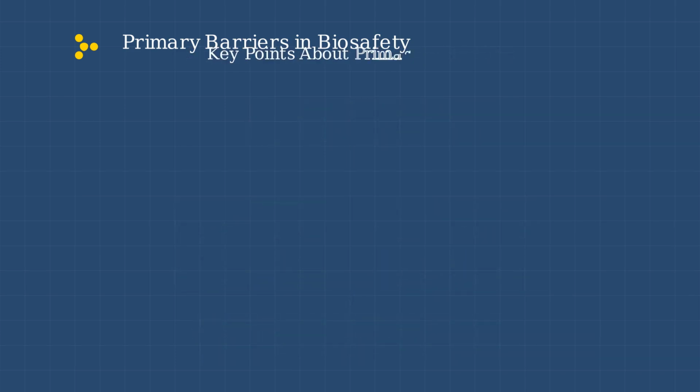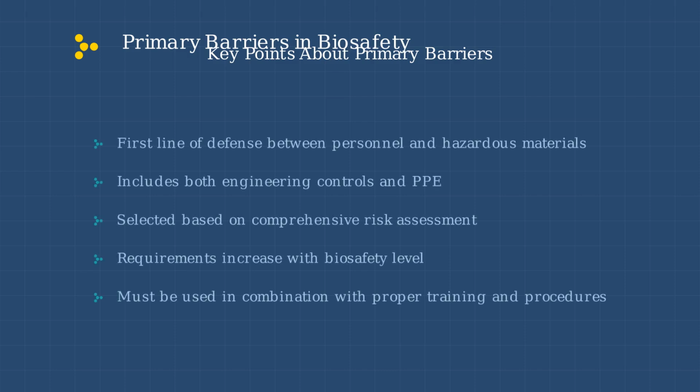In summary, primary barriers are essential components of biosafety practices. They form the first line of defense, include both engineering controls and personal protective equipment, and must be selected based on thorough risk assessment. Requirements increase with biosafety level, and they must be used alongside proper training and procedures.